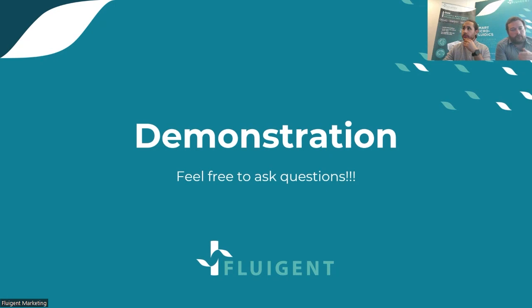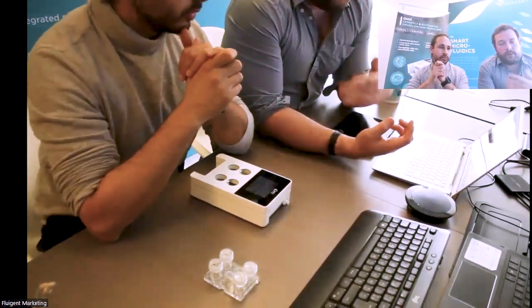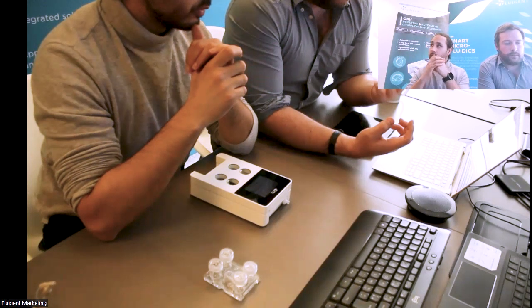As a user, you just have to follow those steps, and you will clean the reservoir this way before an experiment. Also, there is another step at the end of the protocol that is cleaning. Here you ensure that everything that has gone through the reservoir, if there is some deposition of material, gets cleaned so that in the end the system will be sterile.